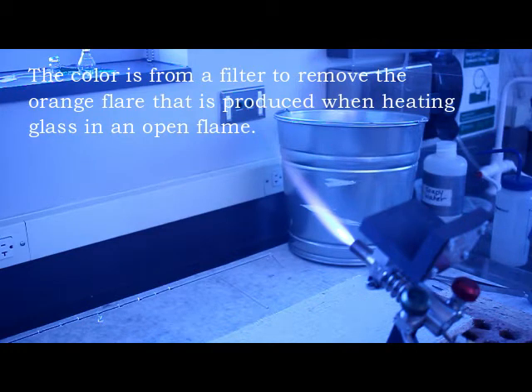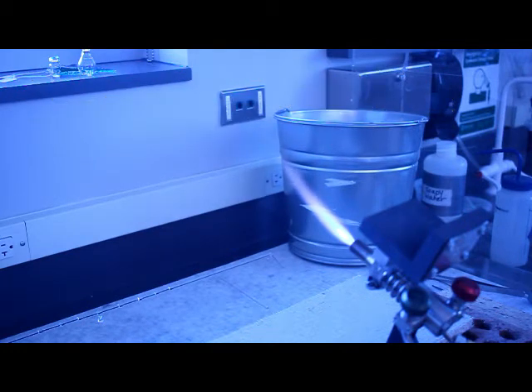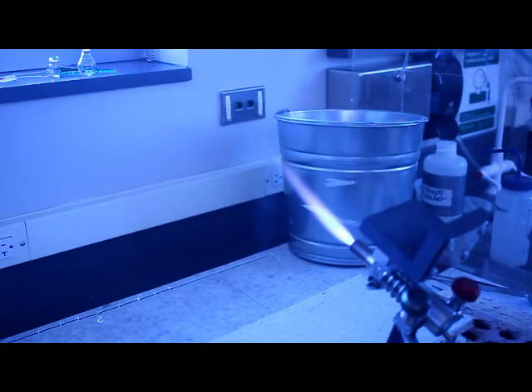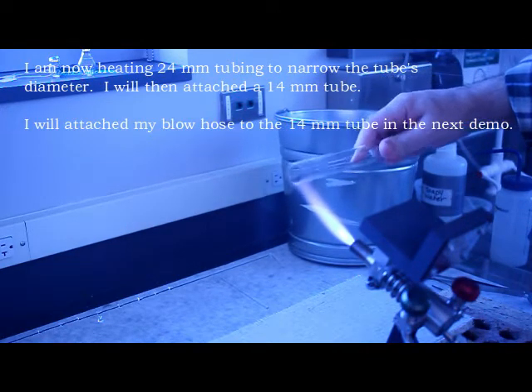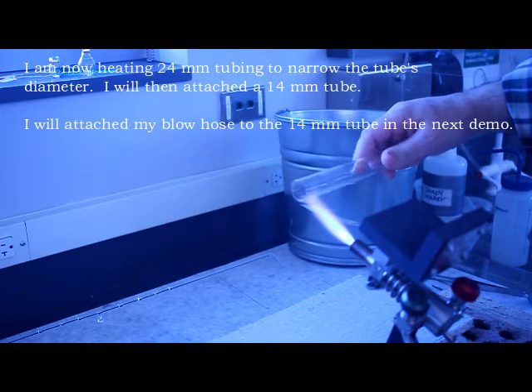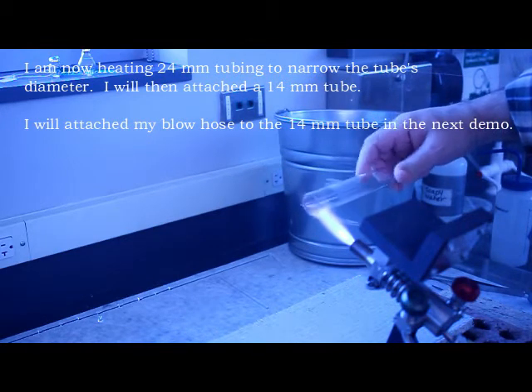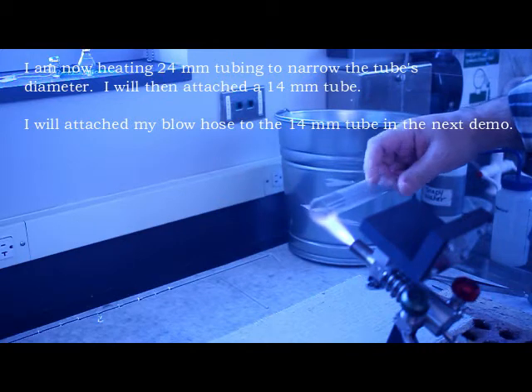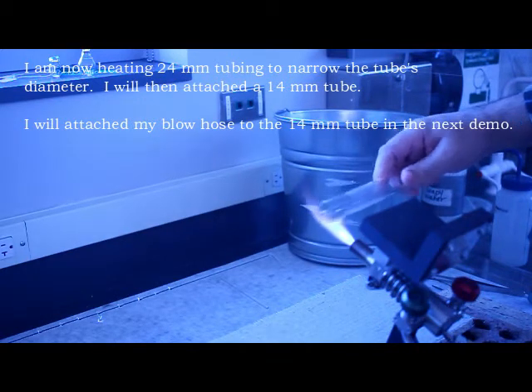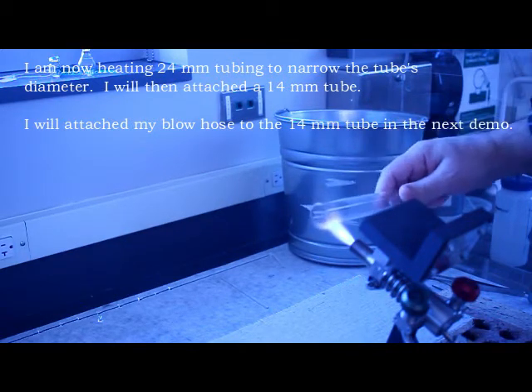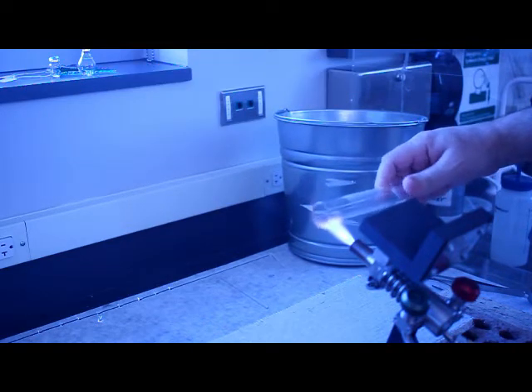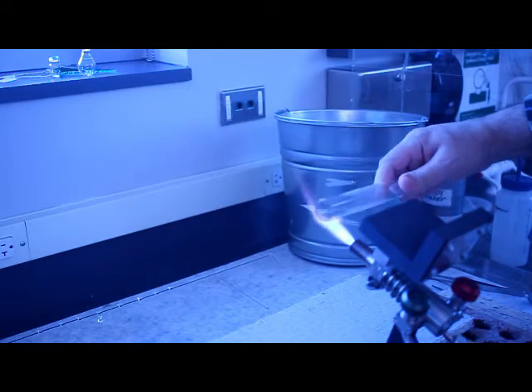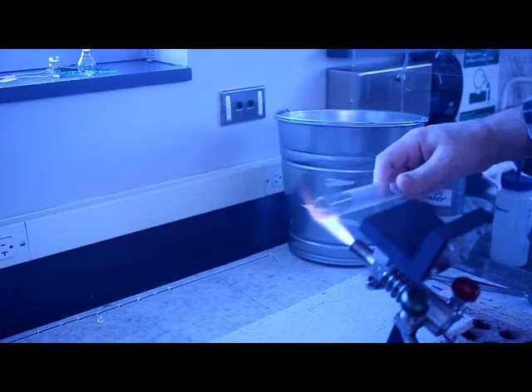First I'm going to be taking 24 millimeter glass tubing, and all of this glass tubing is borosilicate. I'm going to heat the end of it and basically try to narrow the 24 millimeter closer to 14 millimeter, that way when I seal the two of them together it's a little bit easier to get them seated. The 14 millimeter tubing is for a blow hose that I'm going to attach.